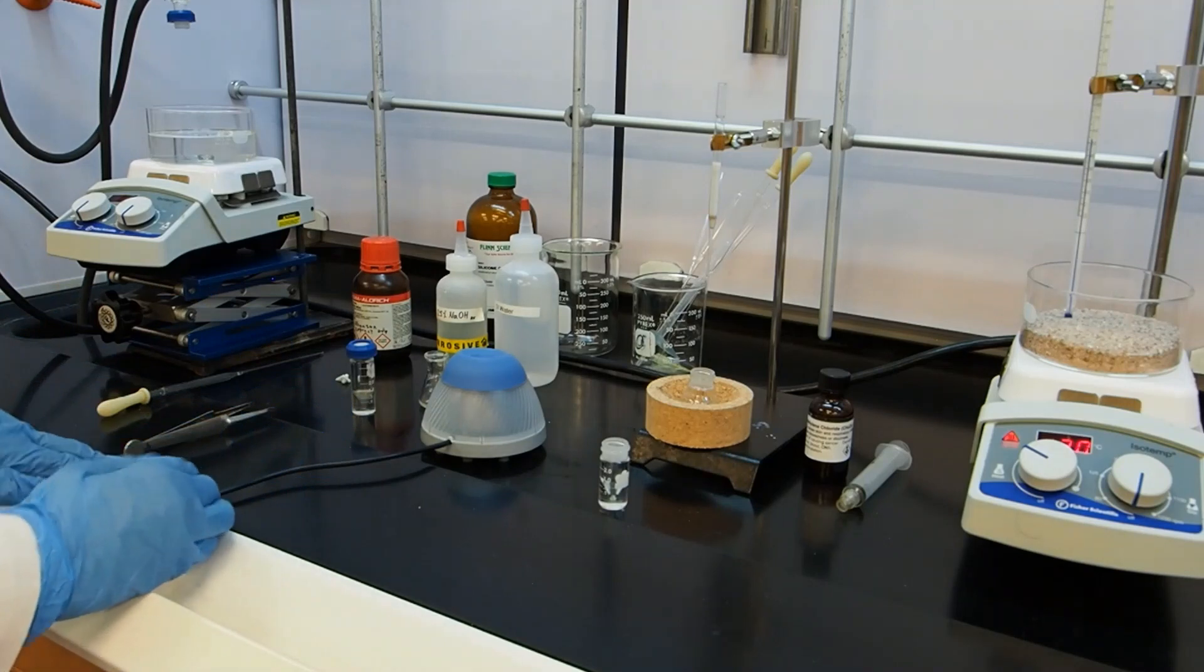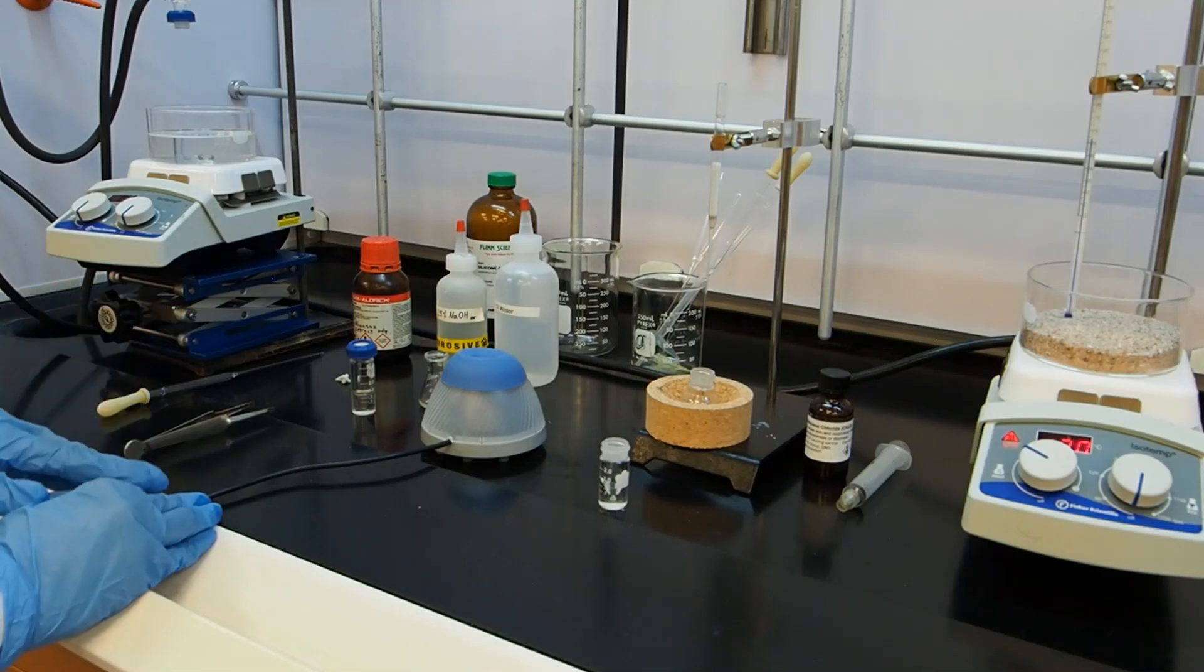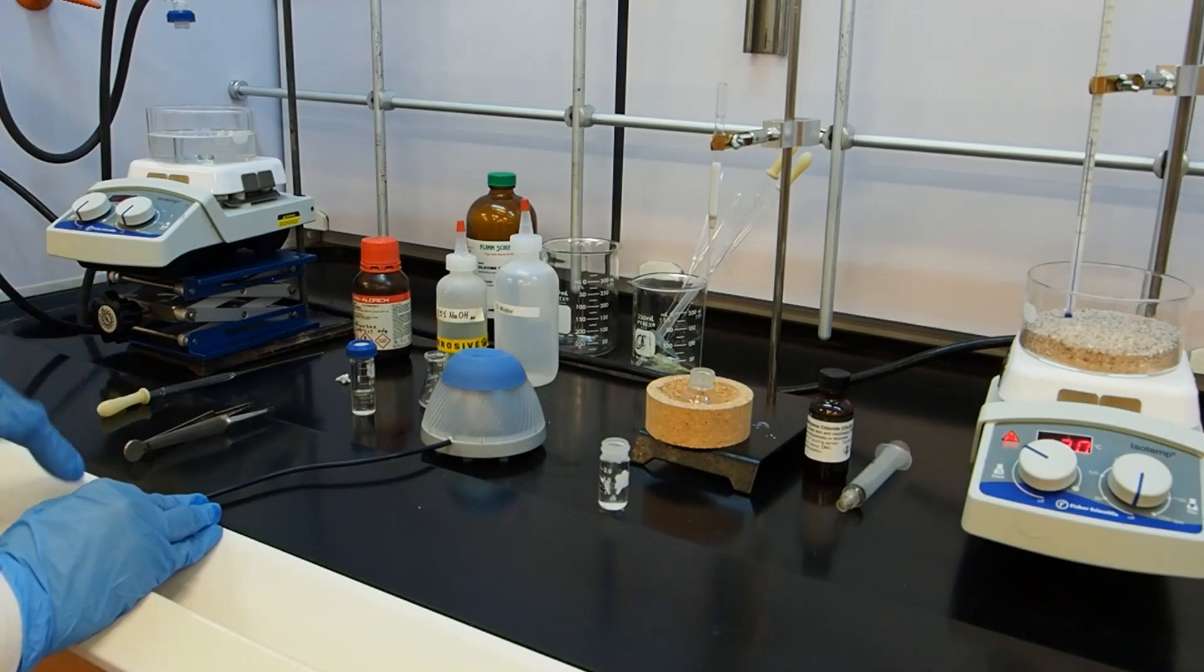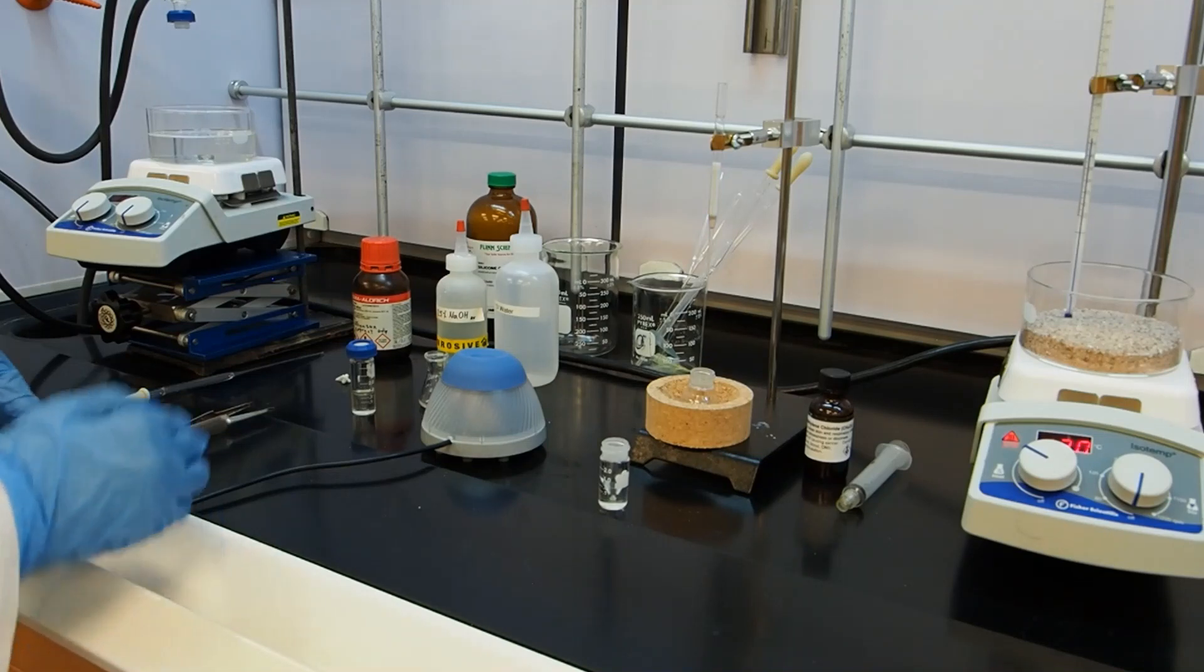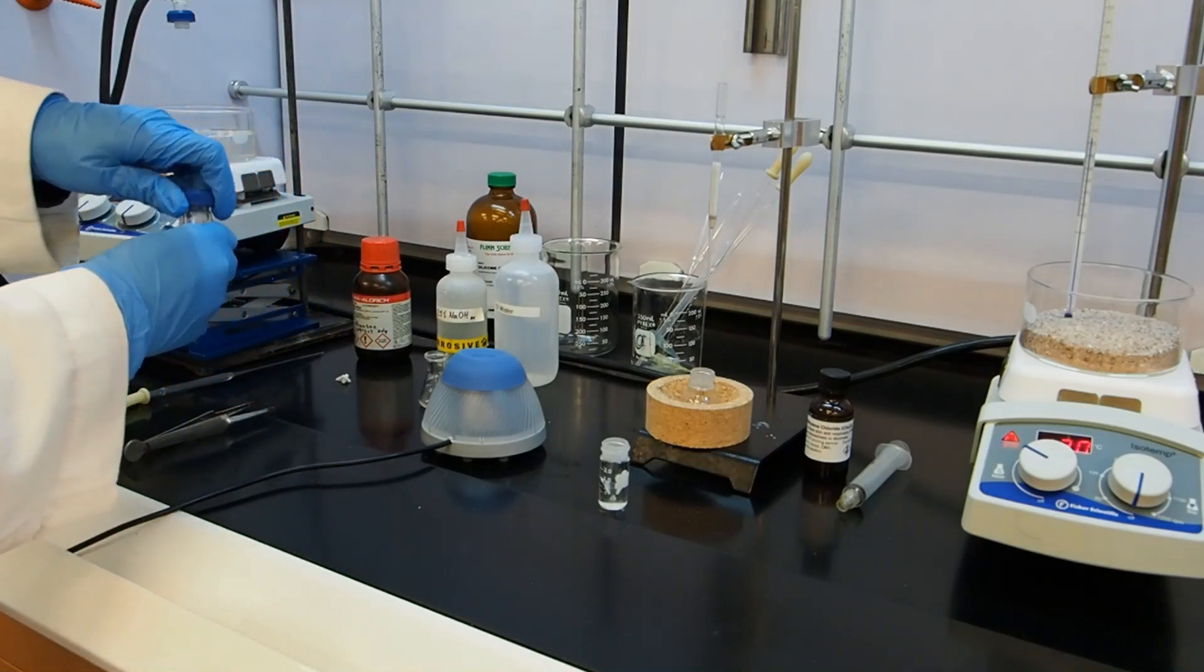So while that settles, I'll recap a little bit. We added ether to our reaction mixture to draw the product out of it. Then we added sodium hydroxide to the separated ether layer to pull the paracresol into the water layer. Once we separated those, we did one last wash with water.